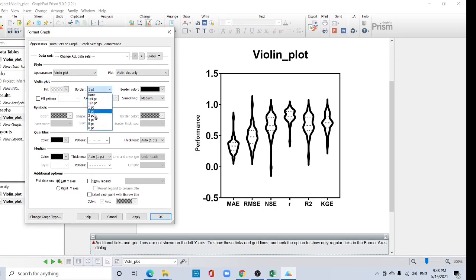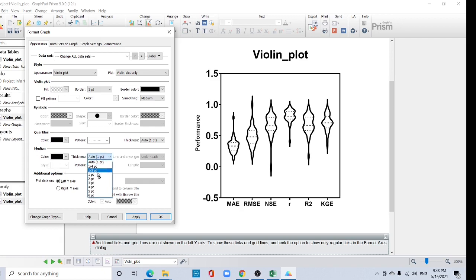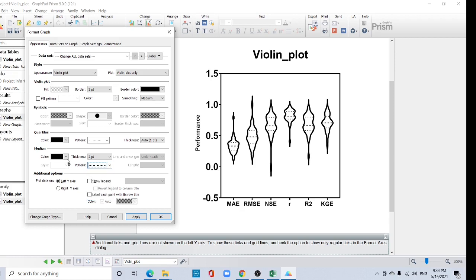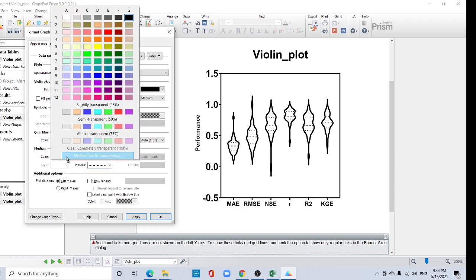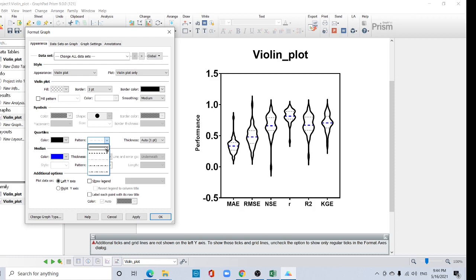Then you can change the color also by clicking this. I want to change the median thickness to two and also I want to change the color. Okay. Here the quartile option, you can change the quartile. Okay.